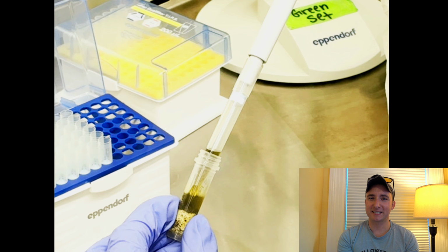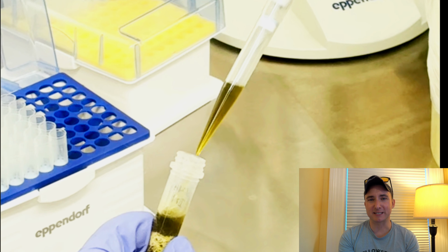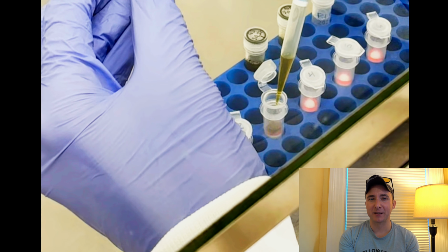Many people make the mistake of assuming that the DNA extraction is asking you for a specific volume to pipette because that's what you need to succeed. But that's not quite right. What a better interpretation would be is to understand that you're being asked to take up to that volume of liquid out of the tube and carry it forward in your extraction.